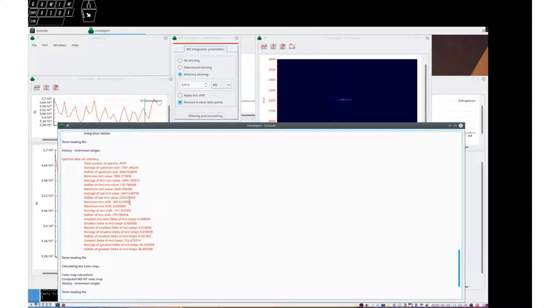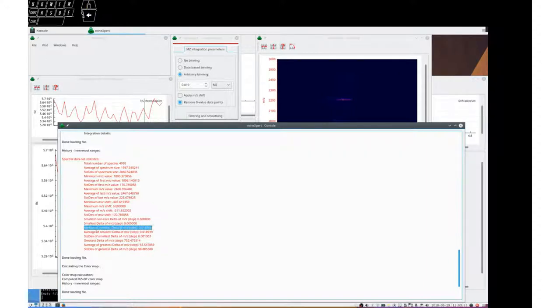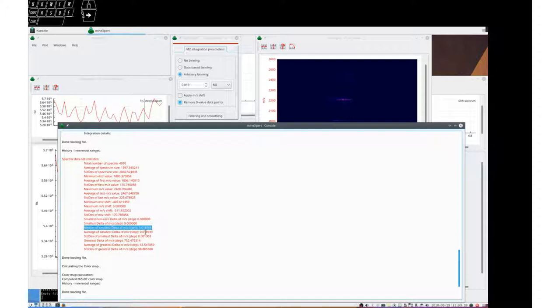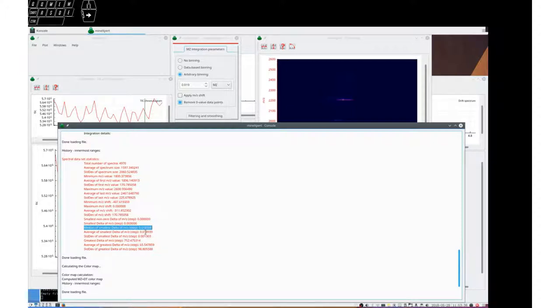And one interesting datum is this: medium of smallest delta of MZ is 0.018. That means that the size of the MZ step in all this spectrum is roughly 0.019 MZ units.